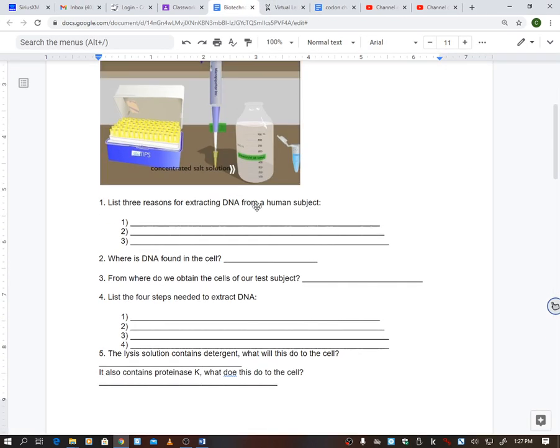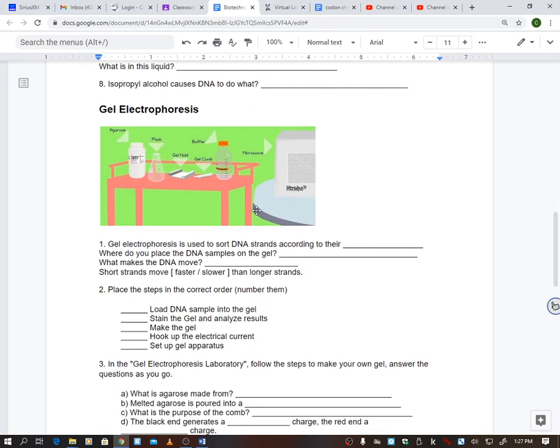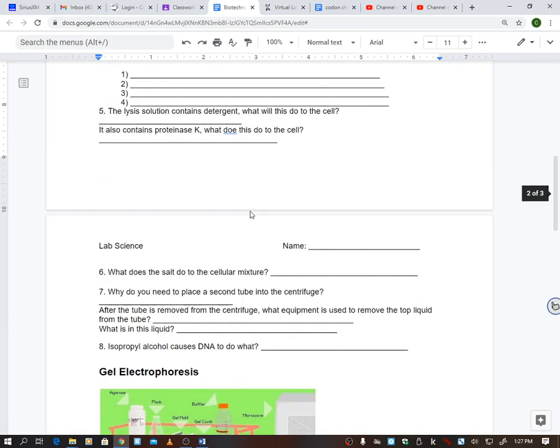So anyways, we will just do the DNA extraction, and then on day 2, I probably will for sure bring in split peas, that kind of thing. I'll post some pictures and images of what they did in class. Alright, so just complete that DNA extraction, just to number 8, and that is it.